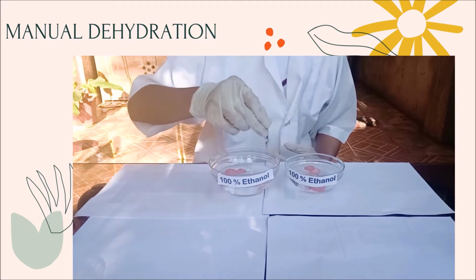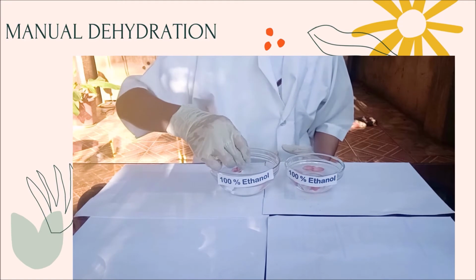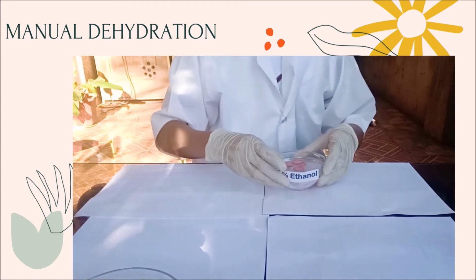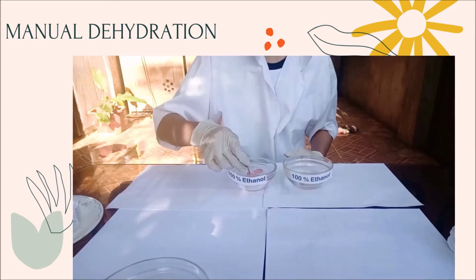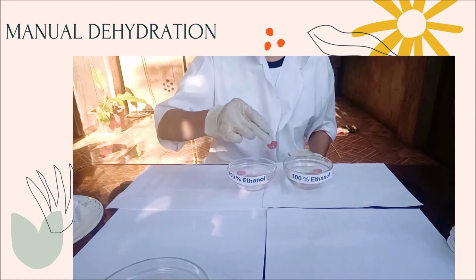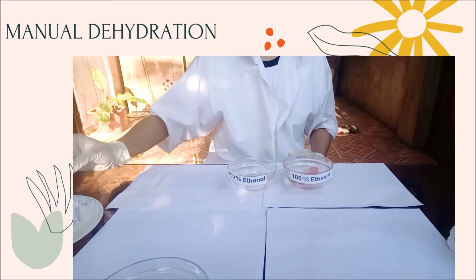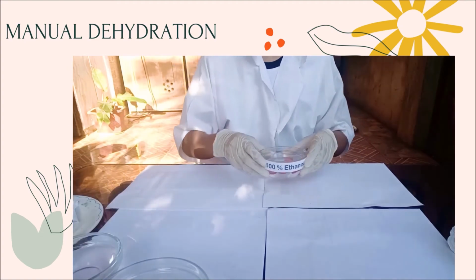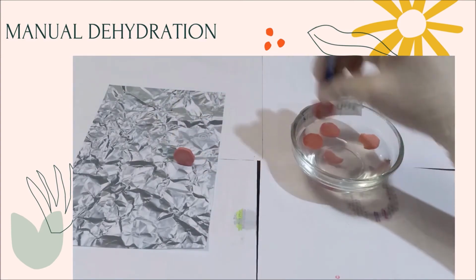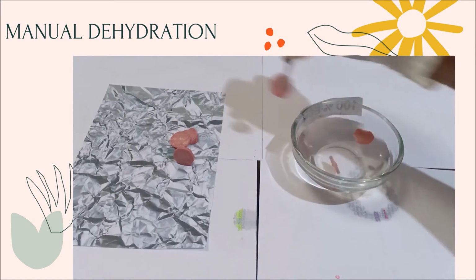Next, immerse your sample in 100% ethanol, this time for a much longer period of time, which is 30 minutes. Lastly, immerse the tissue specimen in another 100% ethanol for 45 minutes. At this point, water molecules should have been removed from our tissue specimen. We will now place our tissue on a foil and store it.